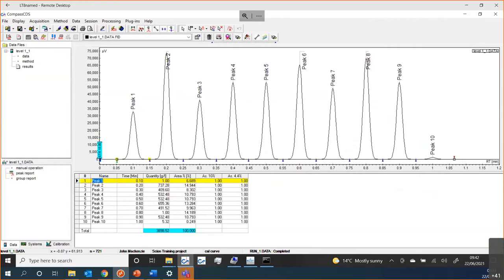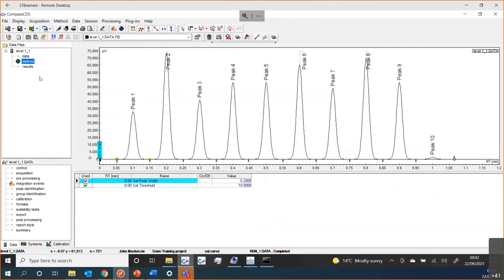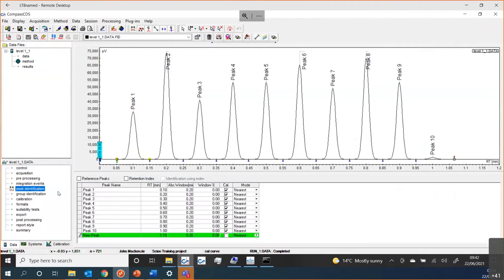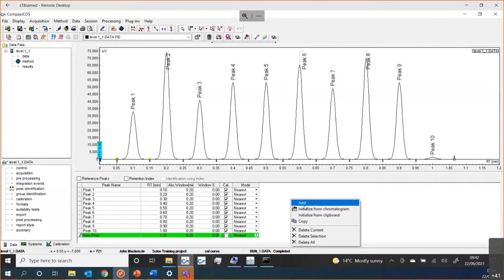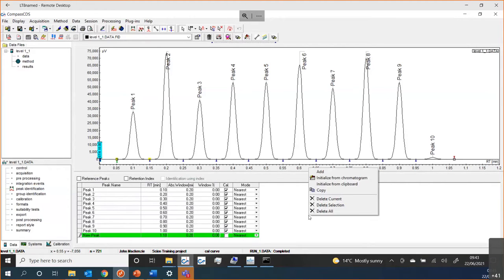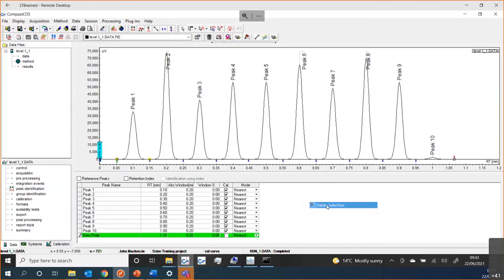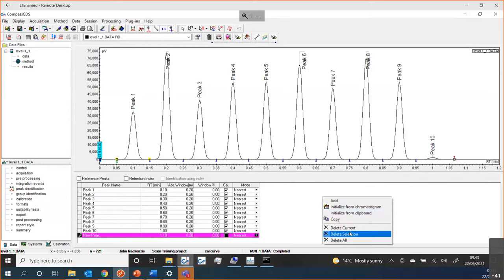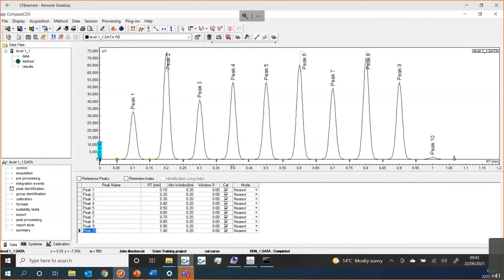So we've looked at a few of the different things in here. We've looked at how we can populate this quite quickly just by doing initialize from chromatogram and then updating. We can copy individual peaks and we can delete peaks. We probably want to delete this extra one that we created, so I'm allowed to just use Delete Selection. It does ask you for a confirmation.